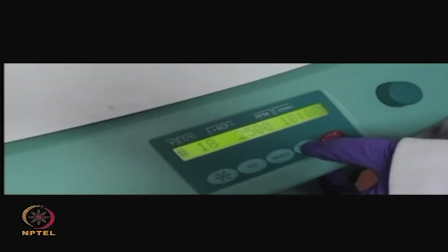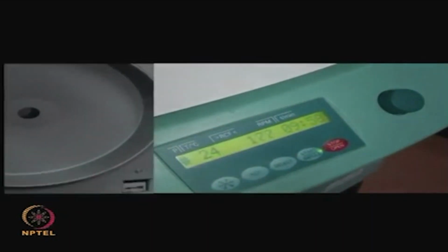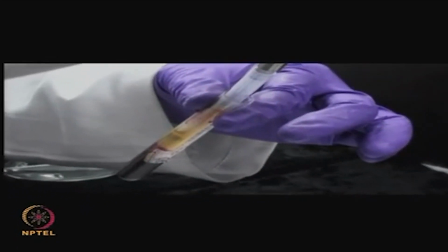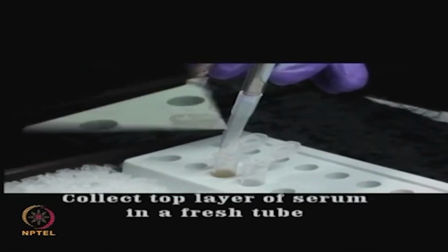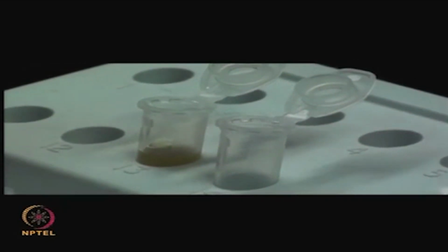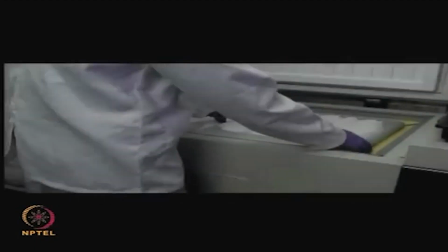Centrifuge the tube for 10 minutes at 2500 rpm to separate the coagulated blood. The blood cells, along with the clotting factors, form the pellet, while the serum containing proteins of interest forms a clear supernatant. Transfer the supernatant containing serum into fresh tubes. These can be stored at -80 degrees Celsius until required for further use.